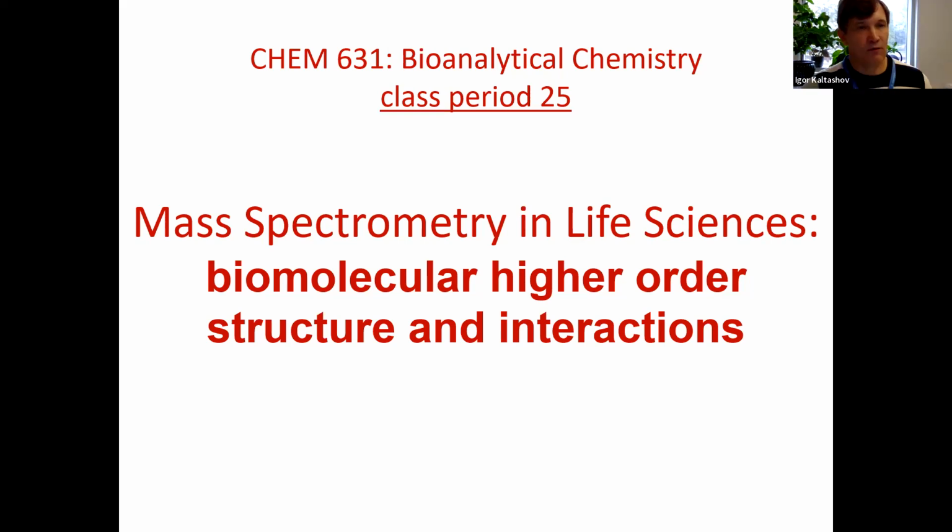Wonderful. So today we're finishing our next to last module. And quite frankly, our next module is going to be very short, just one class period. Otherwise, we would not be able to fit all the student presentations. So today I want to talk about using mass spectrometry to look at higher order structure and interactions of biomolecules.